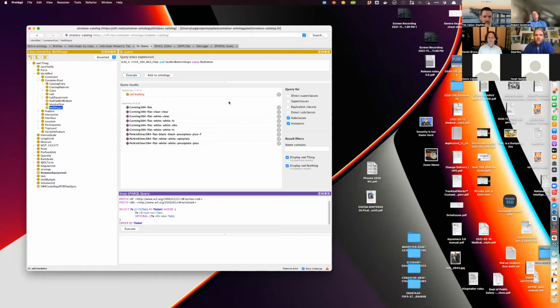And then when you ask for those, when you get these instances, what you're saying is, this is my requirement, and all these plates that you got back should be equivalent with respect to your requirement. Okay, does that answer your question?